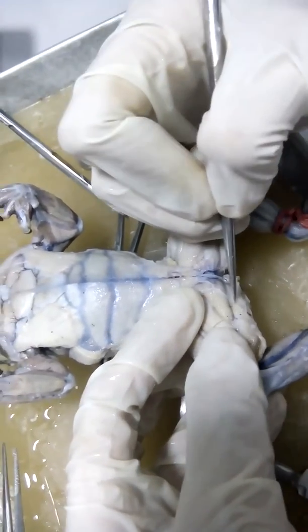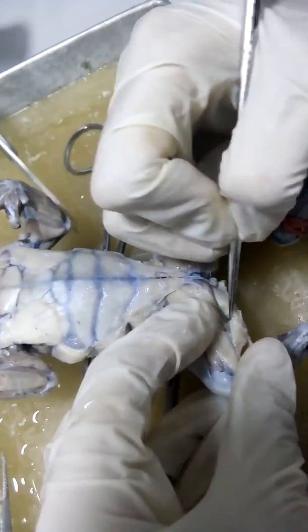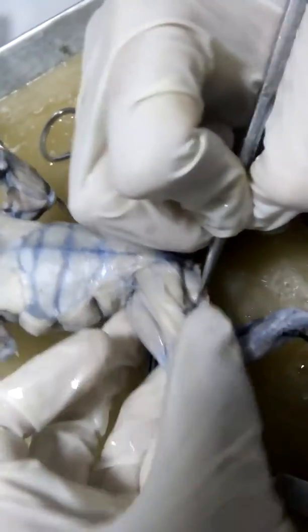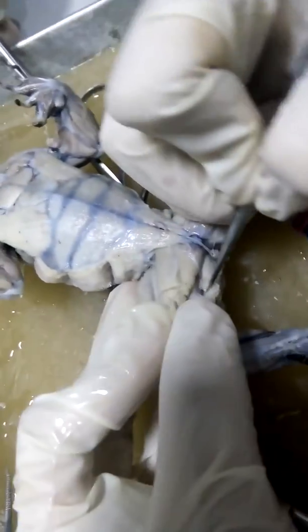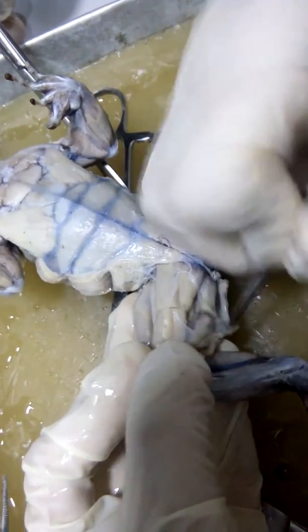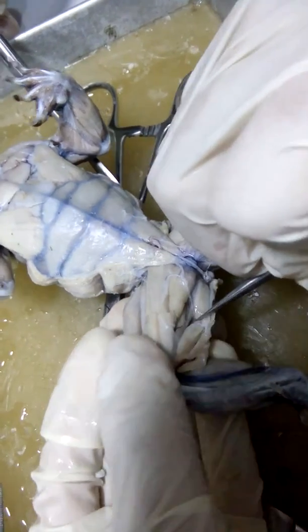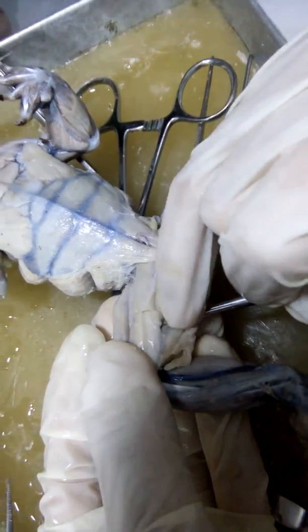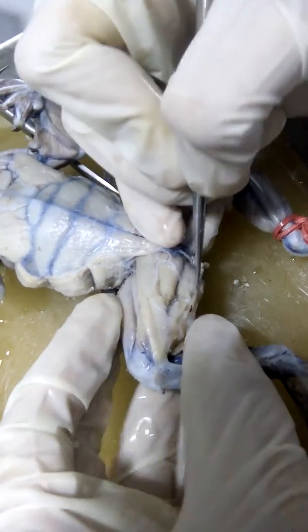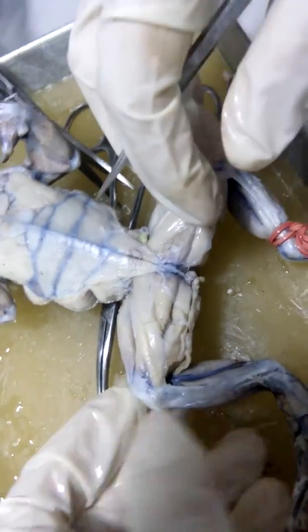Beneath it is your semitendinosus. Still covering, this would be your semitendinosus right here. It has two heads, so you can see here semitendinosus. Okay, finish ang apart. And then this right here would be now your gracilis major, and this very thin gracilis minor.